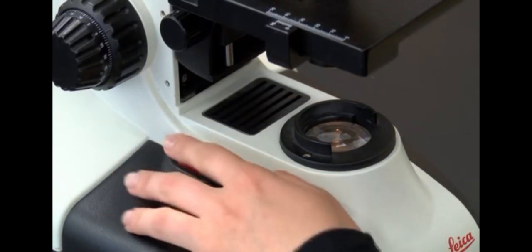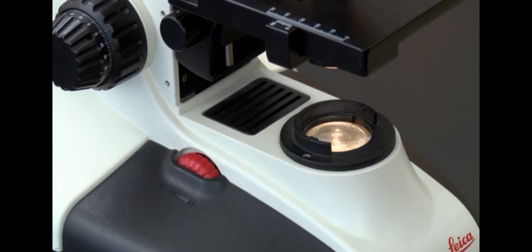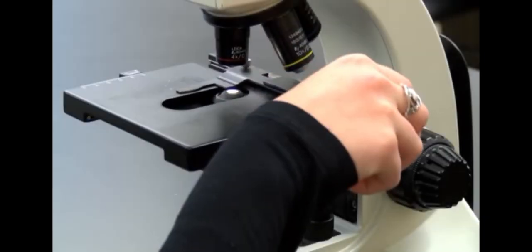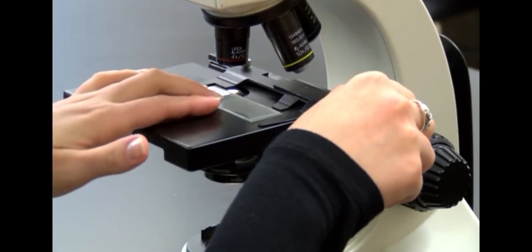Fourth, open the iris diaphragm approximately halfway. Fifth, place the slide in the stage slide holder securely. Be sure the slide has the specimen side up. Roll center the specimen over the light coming from the condenser.